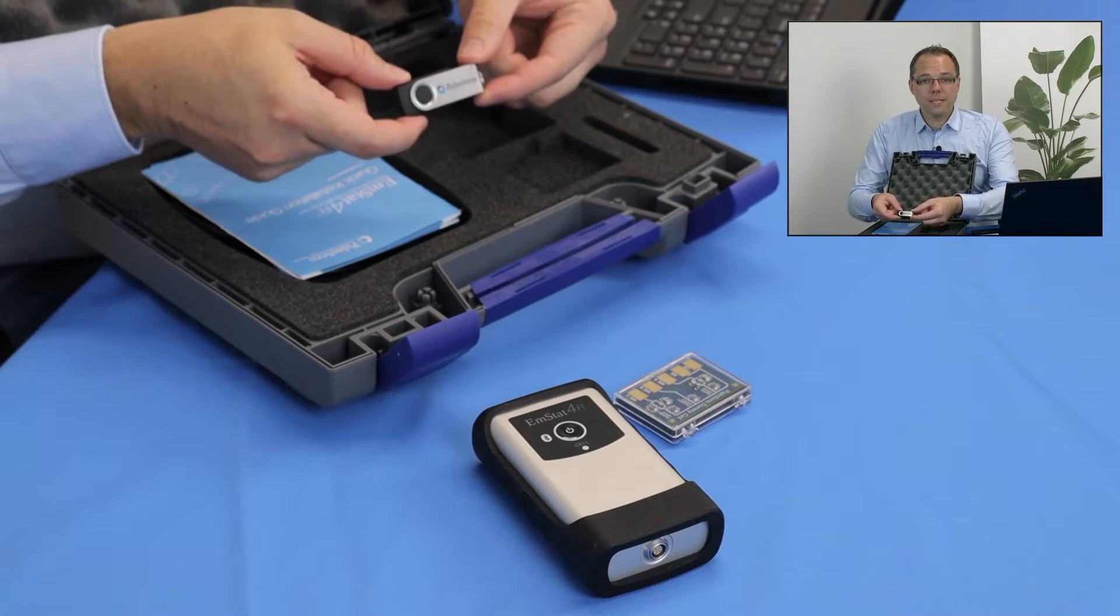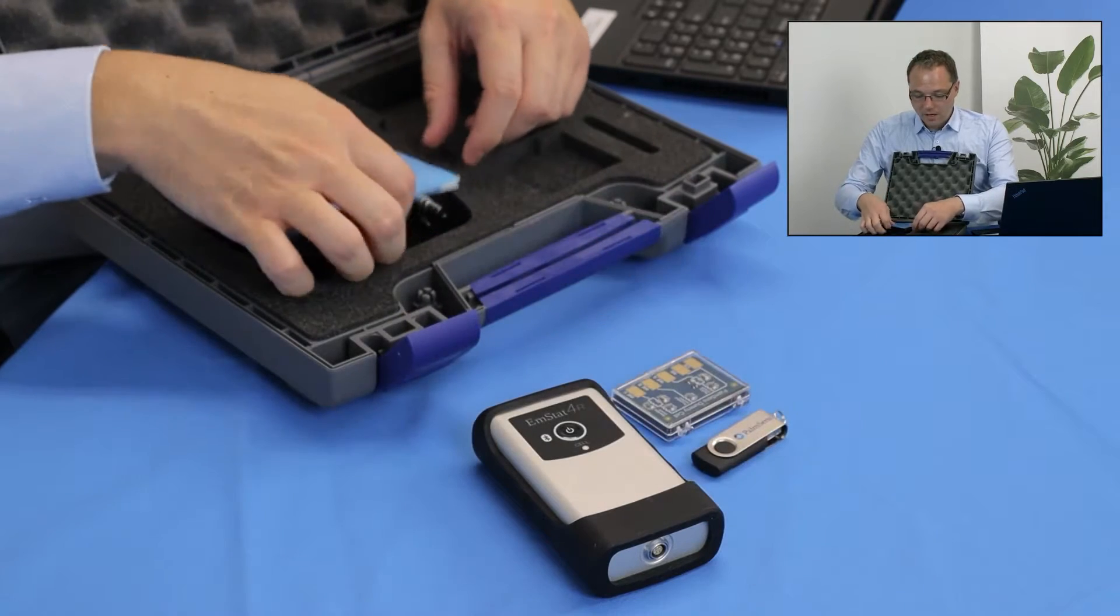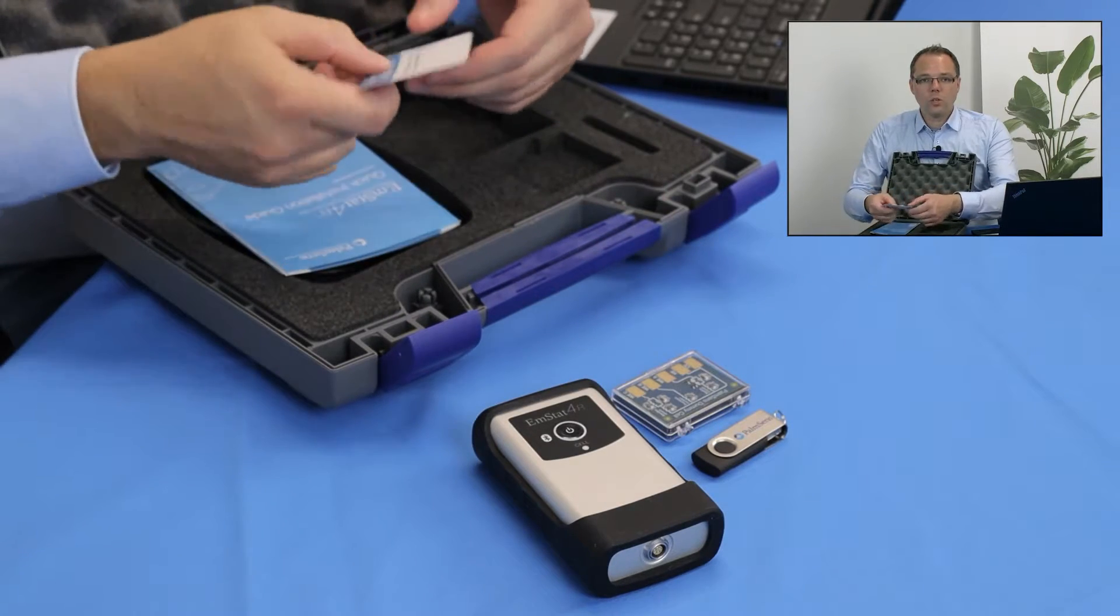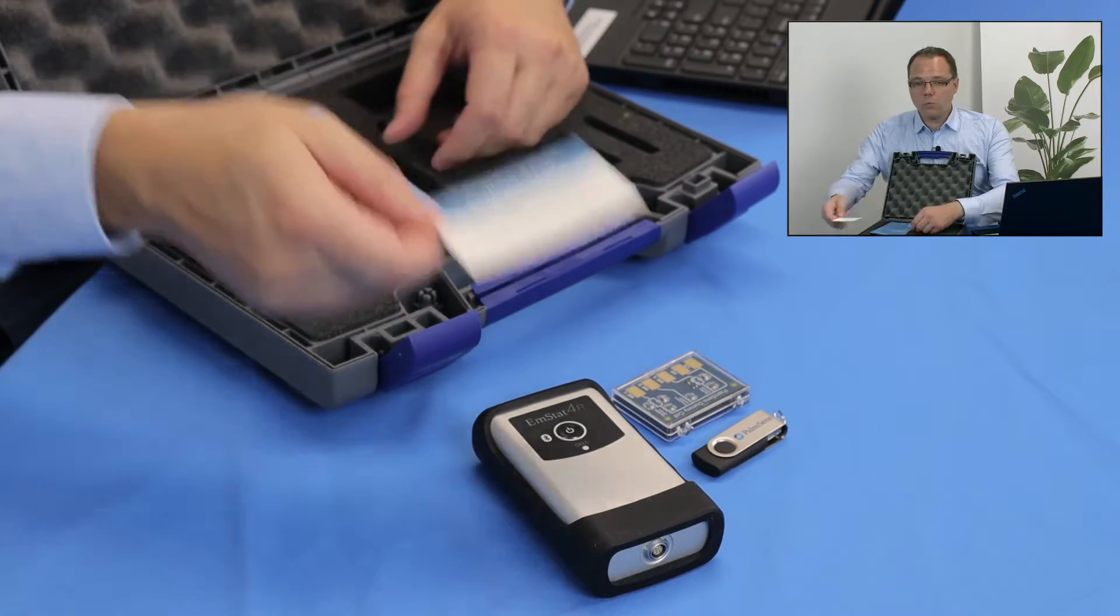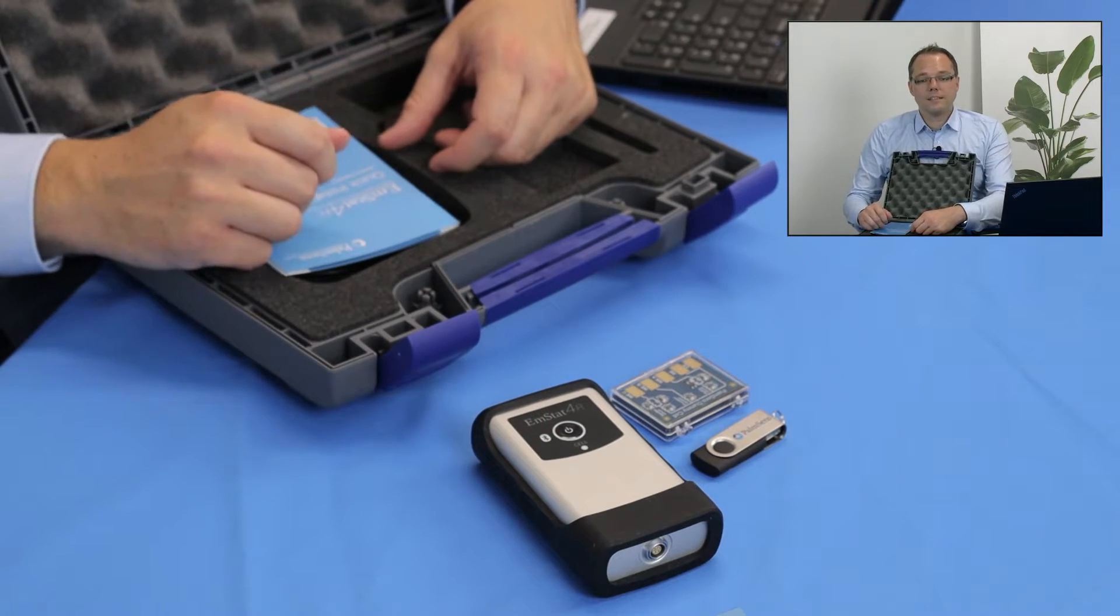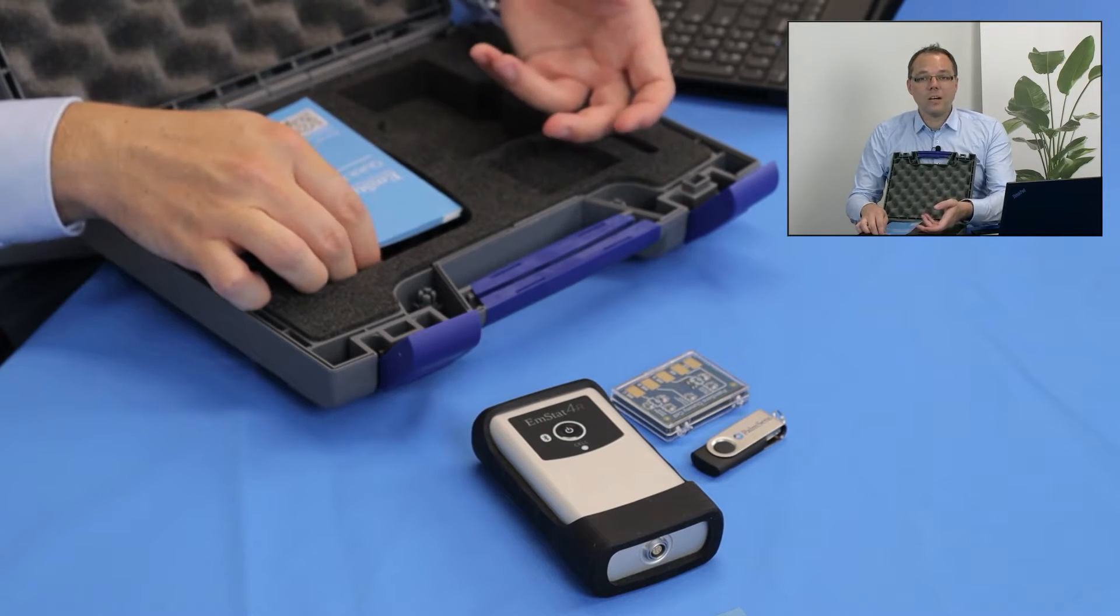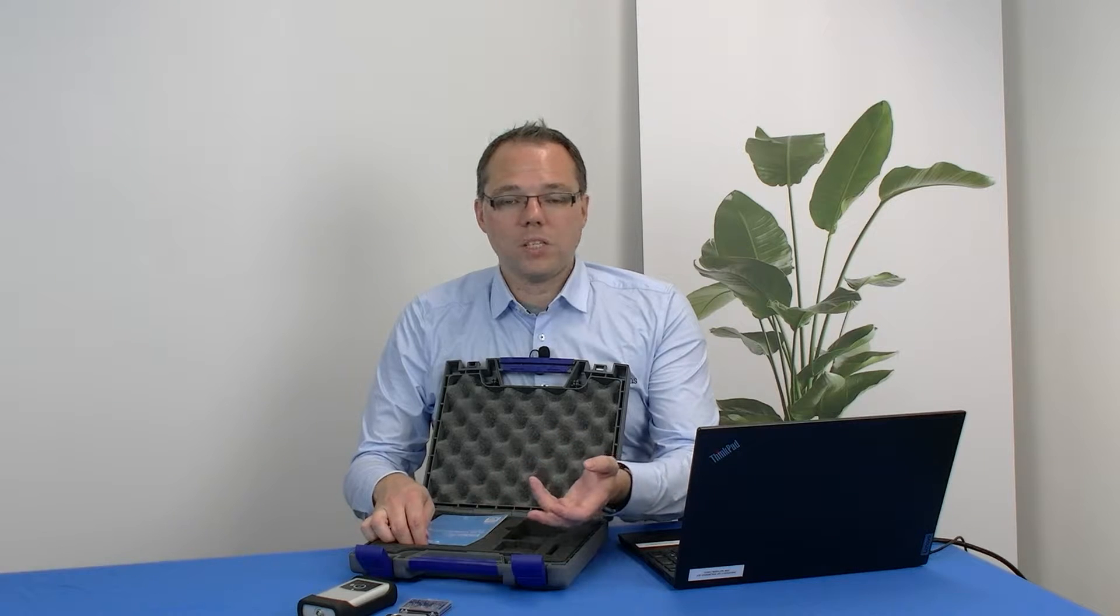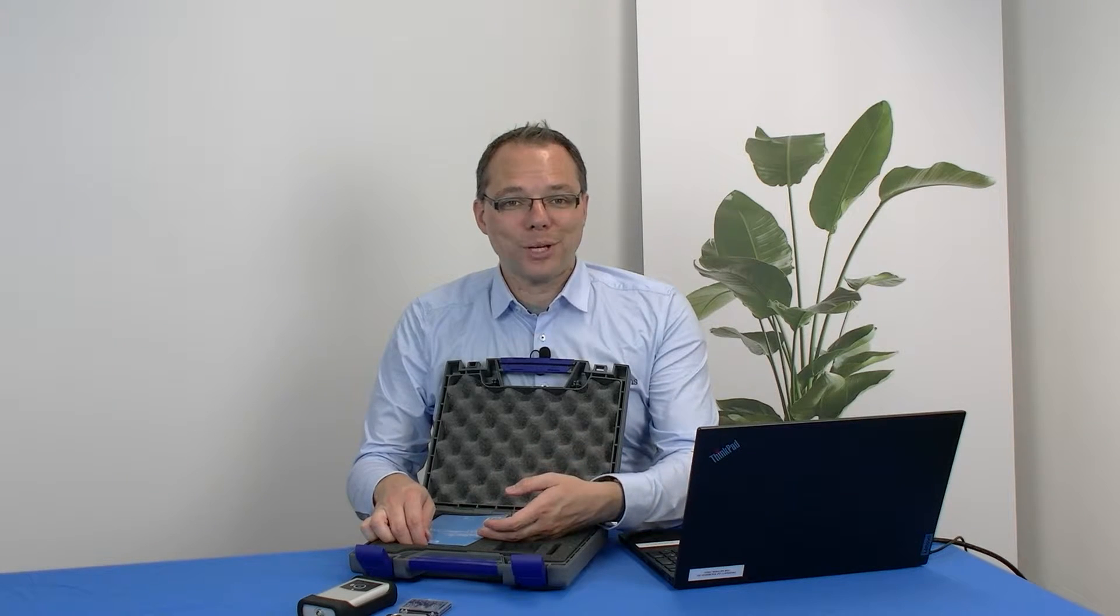Then we have the USB stick, so you can easily install our software as an alternative. You can also use the activation code you will find inside the case to make an account on our download portal. And then you can download PS Trace basically anywhere where you like.